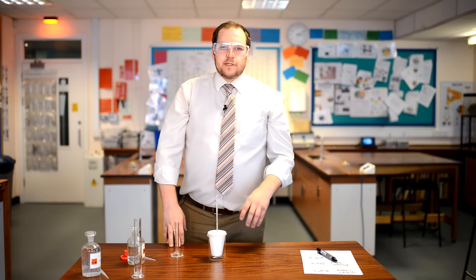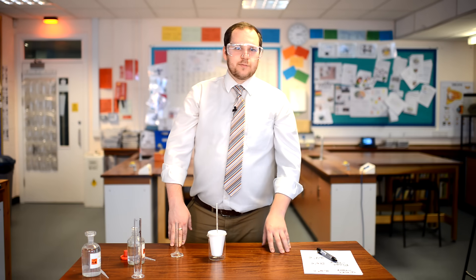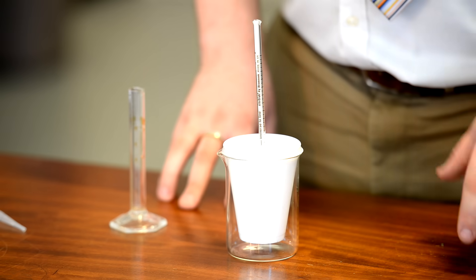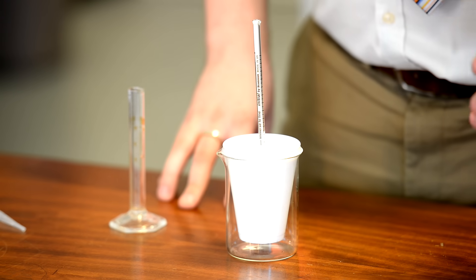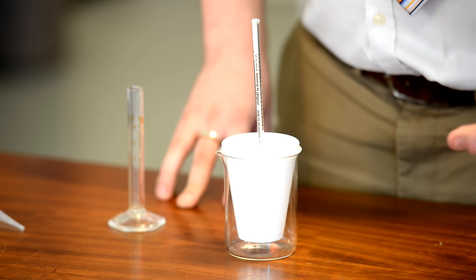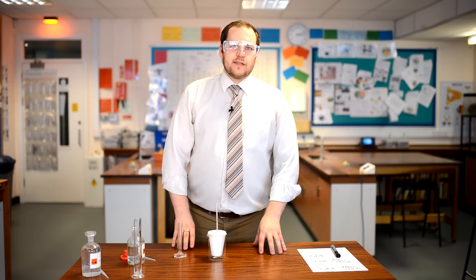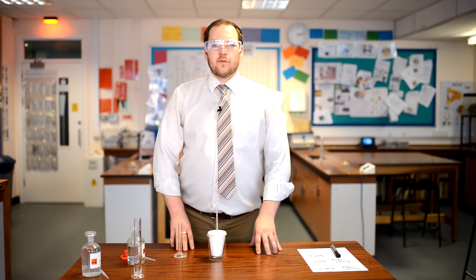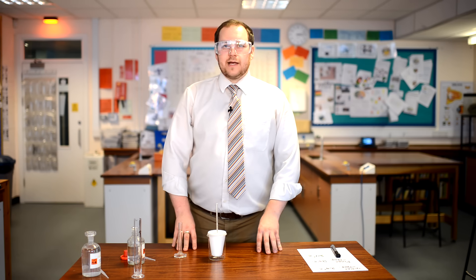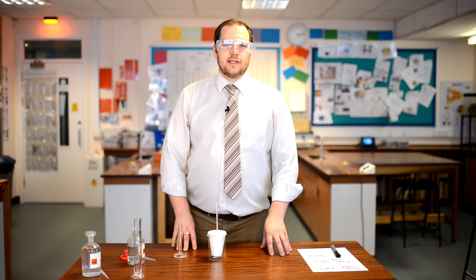Keep adding 5 centimetres cubed increments up to 40 centimetres cubed total of sodium hydroxide, recording the temperature after each addition. The quicker you are at adding the sodium hydroxide, the less heat is lost — that's the whole idea of this experiment, given that it's about temperature changes in an exothermic reaction. You may begin to see the temperature level out or even start to drop at larger quantities. Try to think about why that is in terms of limiting reactants and heat transfer.